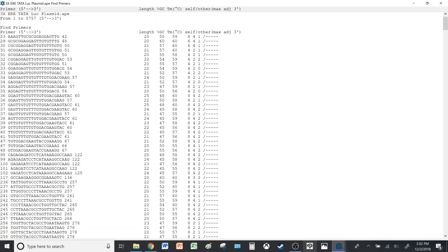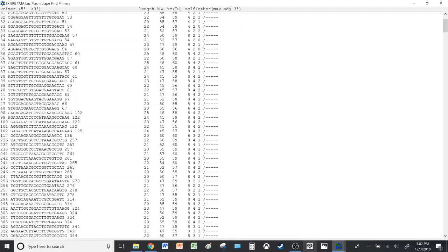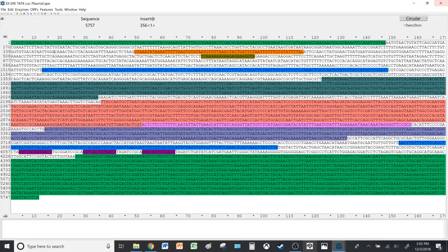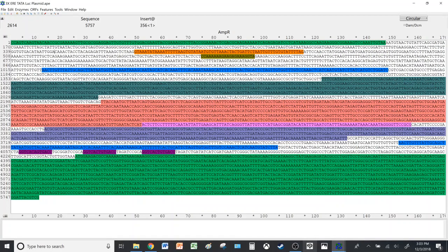So you can use that for primer design, or you can also use, I think there's a calculator of some sorts online for designing primers if I remember correctly. I'm not really sure about that.